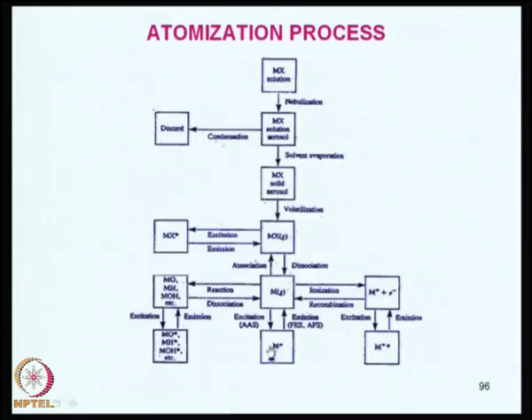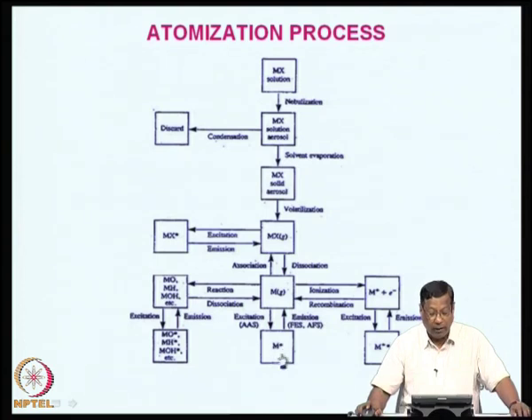The metal atoms are formed here, and this is good for AAS, but if it emits the radiation, we go back to the same process. So, basically MX solution aerosol, MX solid aerosol, MX gaseous, and from the gaseous it can get excited, the molecular excitation, which is not good for us.